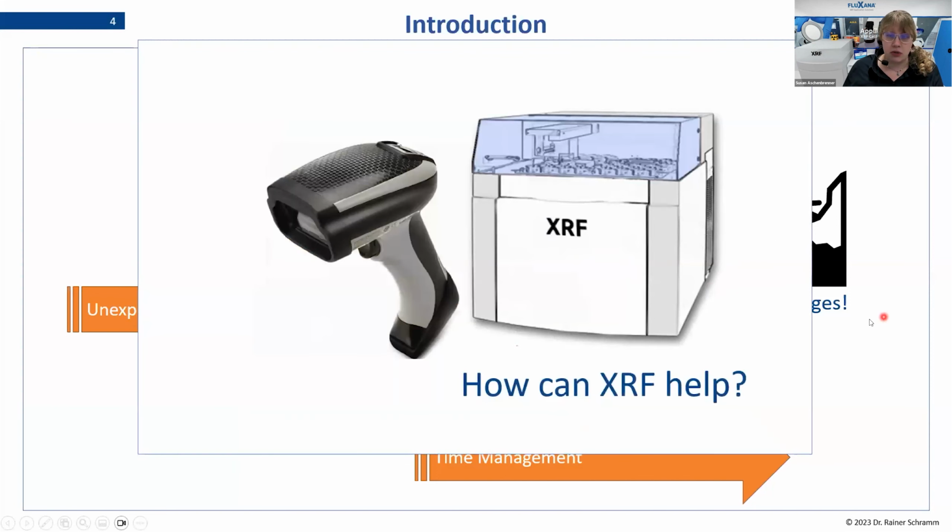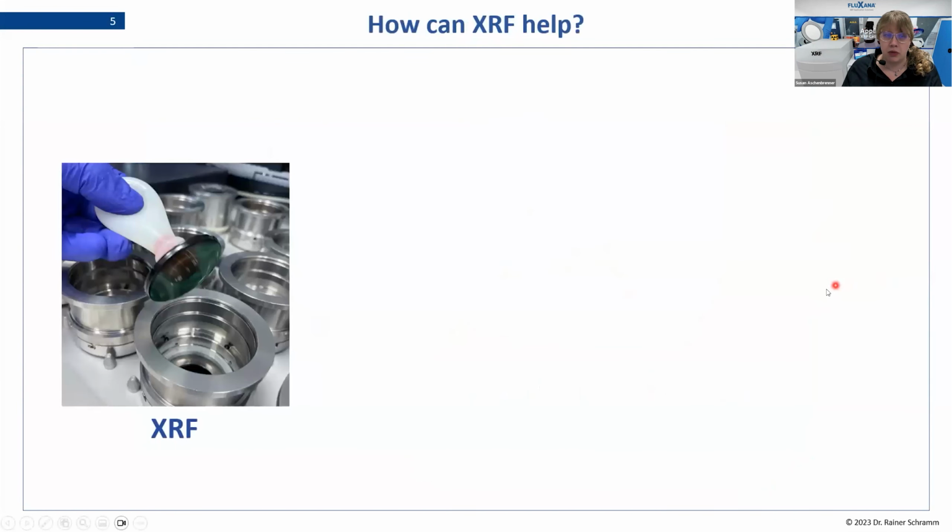The question for today's webinar is how can XRF help us to analyze our recycling materials in an efficient way. And to kind of lead to this topic, I would like to start with the advantages that XRF measurements have.